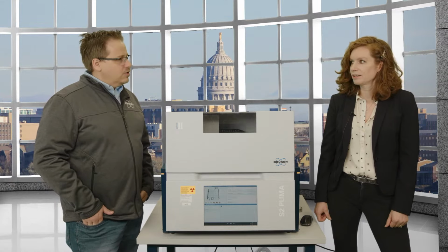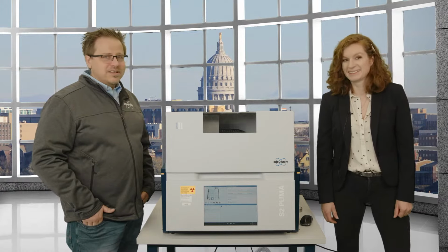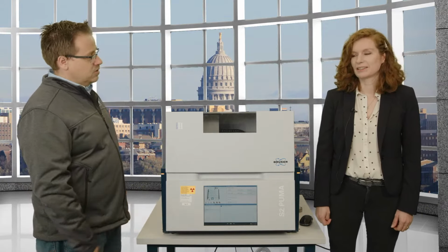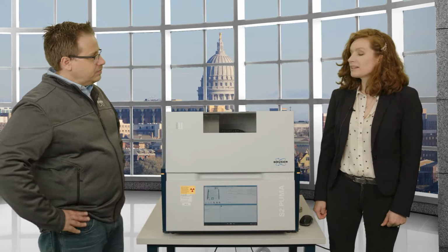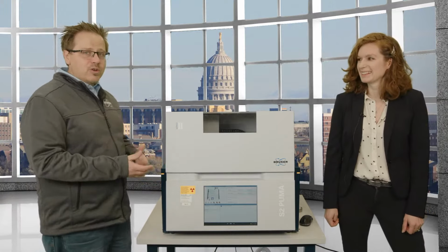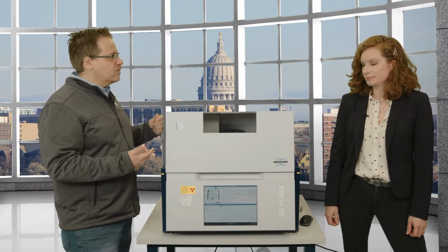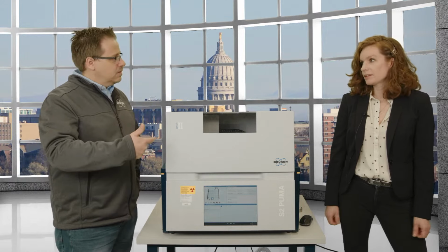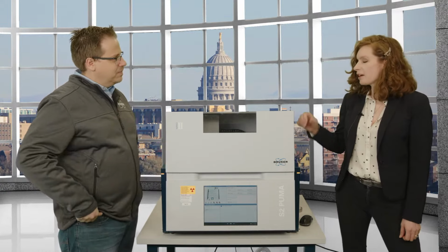So machines have changed quite a bit over time, right? I kind of remember back in the day, these machines were so huge, and the generator itself would have been even bigger than this whole machine. For the larger WD systems. For the EDXRF system, it depends on how far you go back. I think out there, sometimes the perception is that you have to have this huge facility. The reality is that you've got everything from the larger WDs these days, true. On the other end of the spectrum, you got handhelds. And then here, in that happy middle spot, you got the benchtops these days. That's right. We also have benchtop WDXRF.